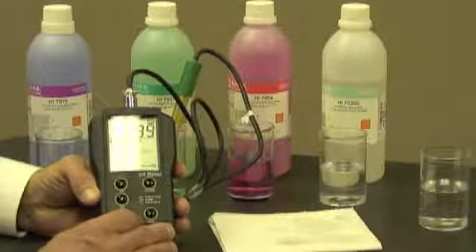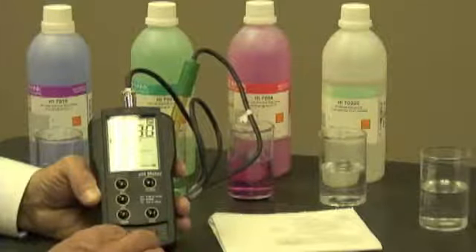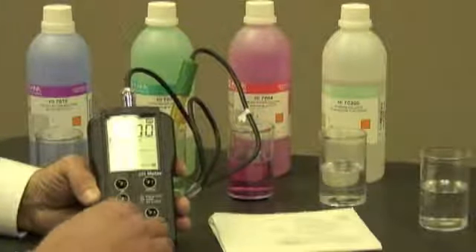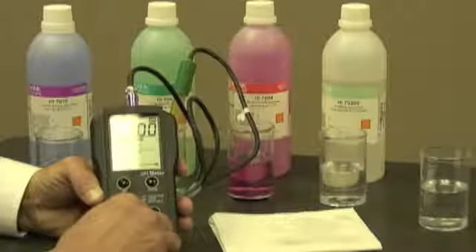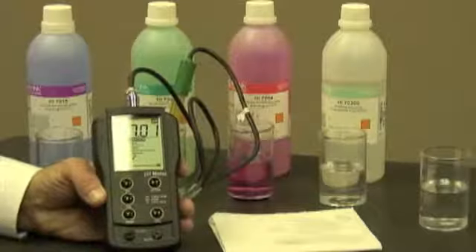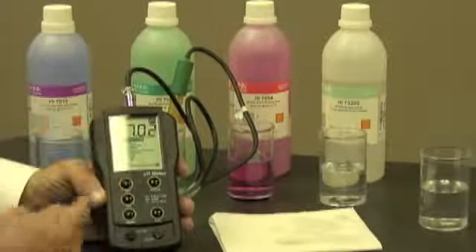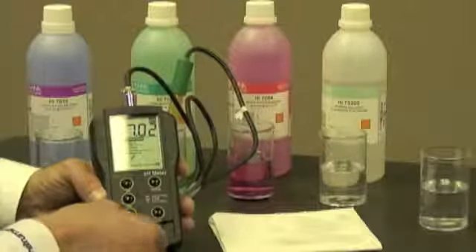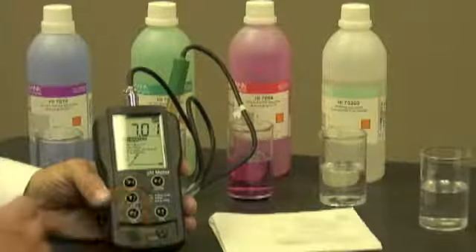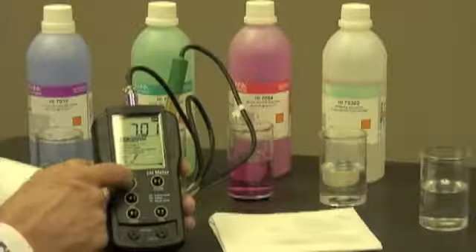Now the meter says 6.99. So what I want to do is adjust the offset to 7.01. I'm going to turn the knob — I can turn it either with a screwdriver or a coin. I've gotten it to 7.01; it went to 7.02, so I'll give it a little tweak and we're at 7.01. I'm going to push the pH button.